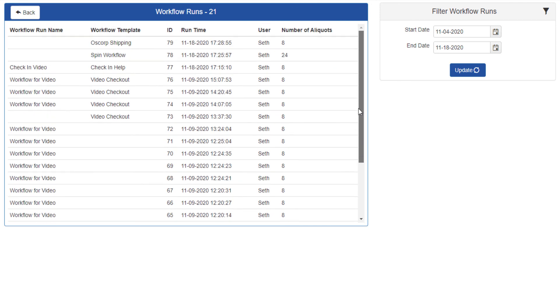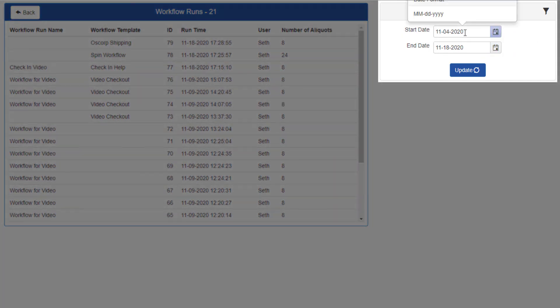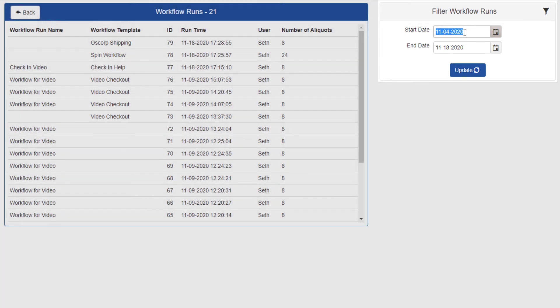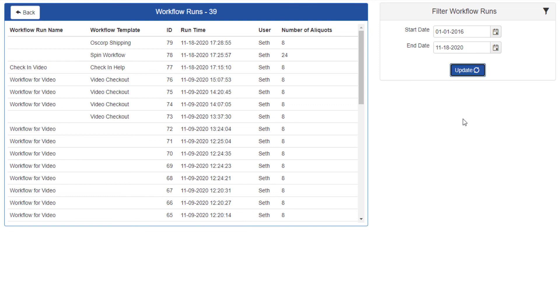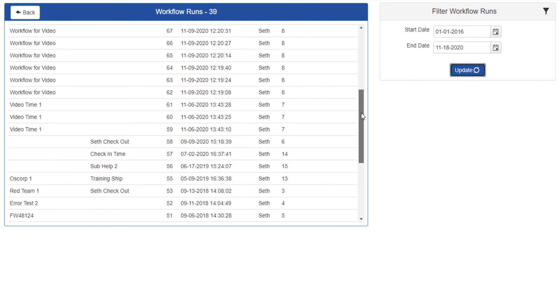The workflow history list will be pre-populated with every workflow processed in the last two weeks. To search using a different date range, change the start date and end date fields. As you can see, you can access the history of every workflow ever run in your system.